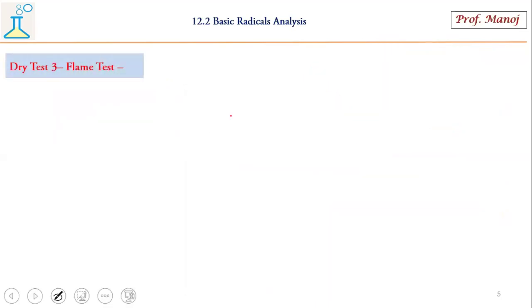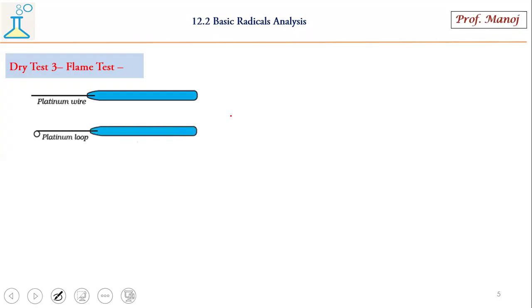Using the flame, we do a test known as Bunsen burner flame test. Now, how do we carry it out? Let us see the procedure. We use an instrument known as a platinum wire. You get this in the market at any stationery shop. You have to make a circular loop at the beginning of the platinum wire. Dip it in hydrochloric acid and salt paste.